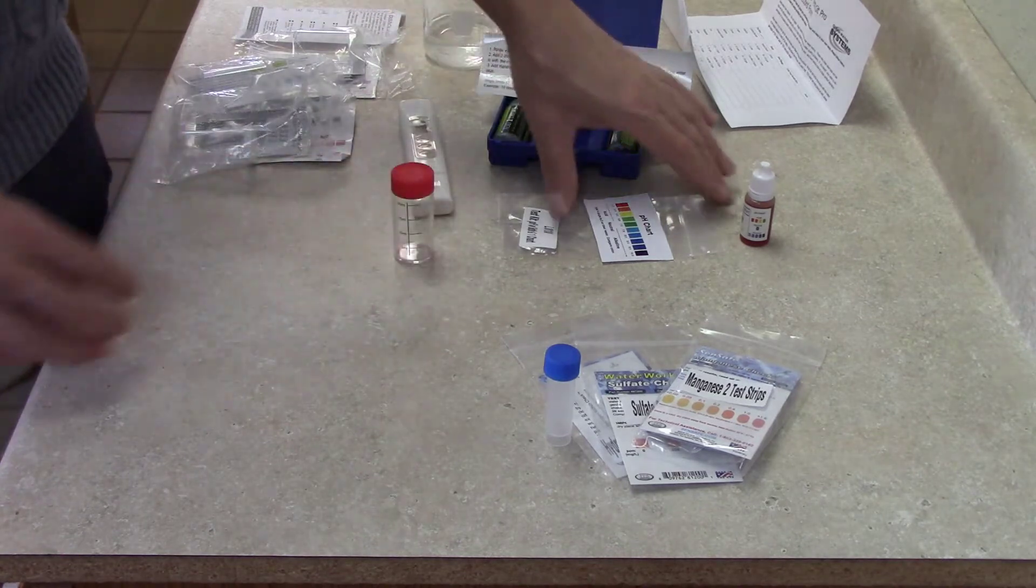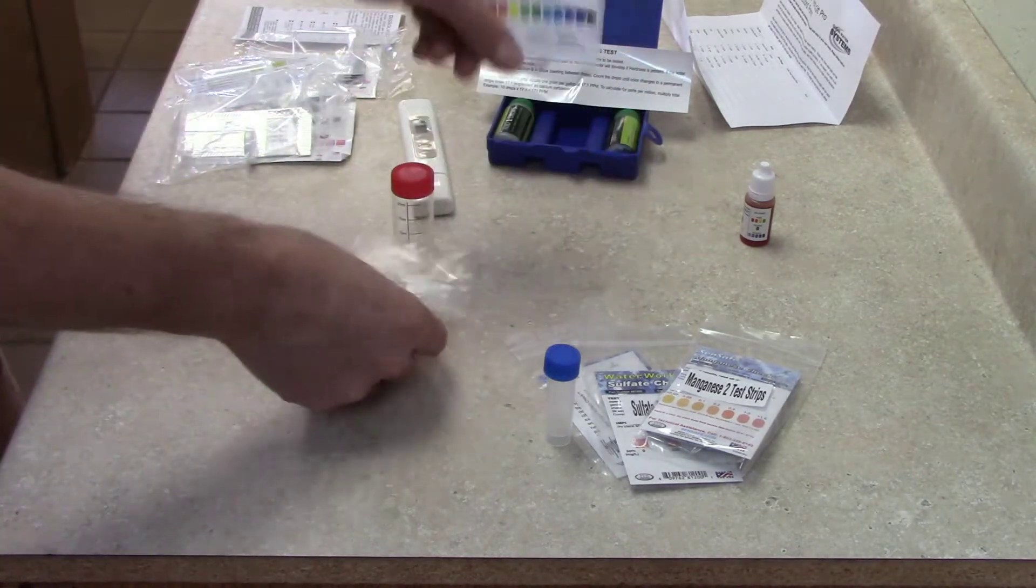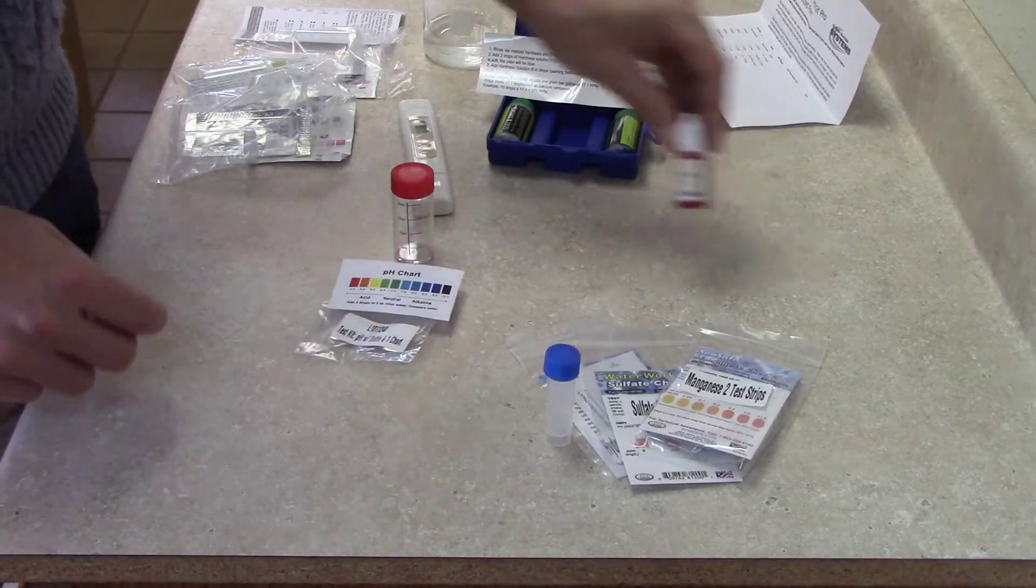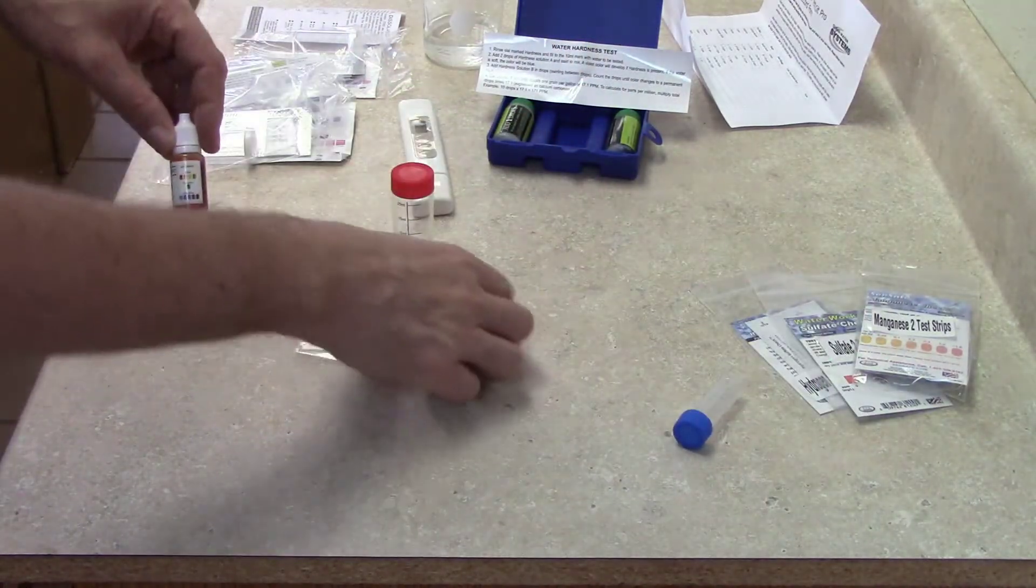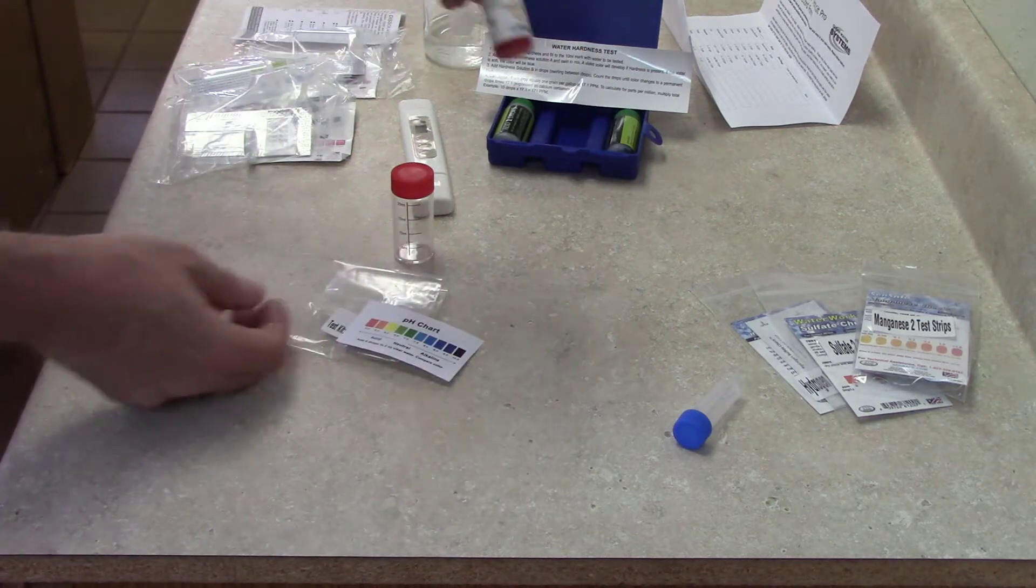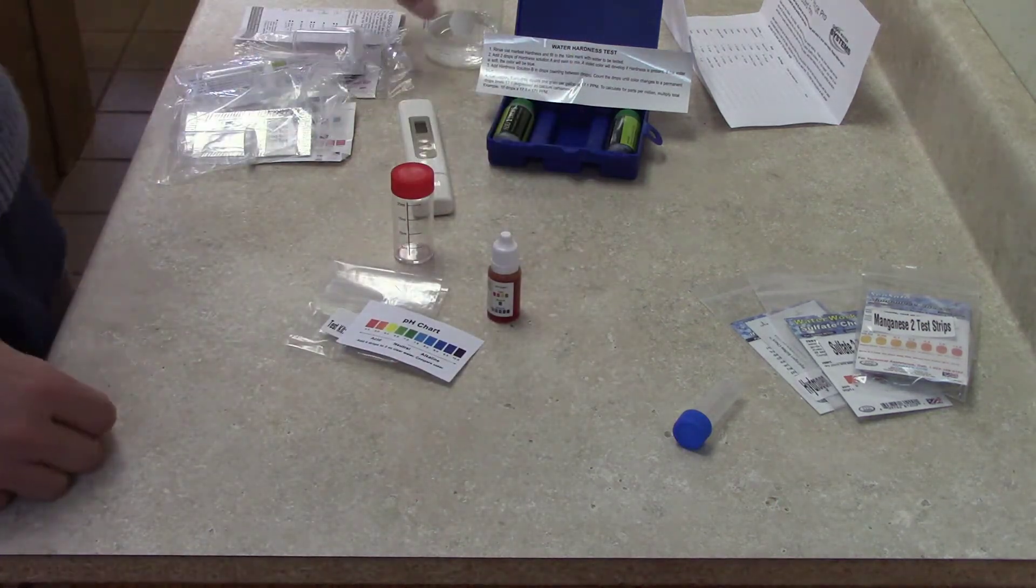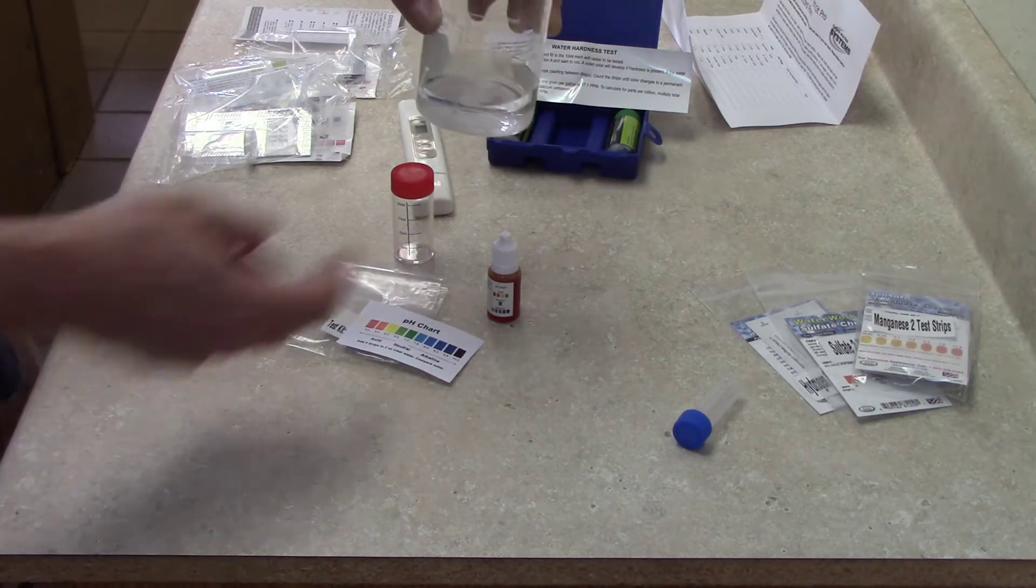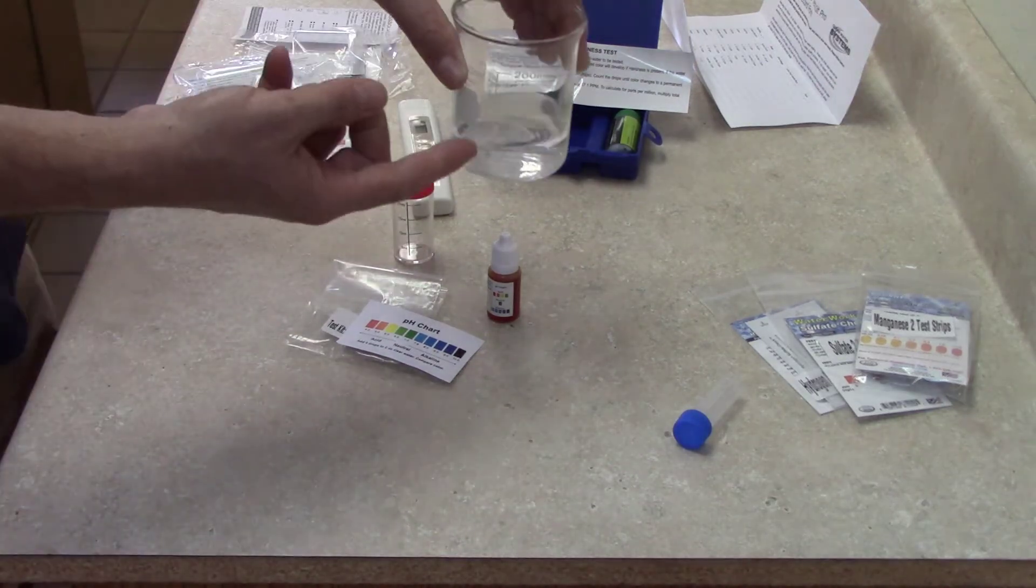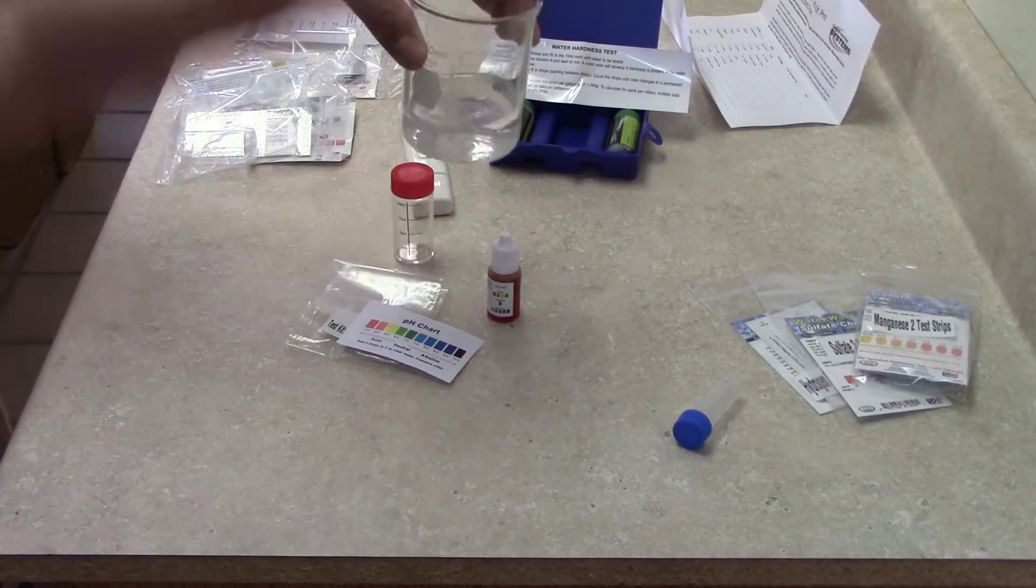Now the last one is for pH. There's your color chart to confirm and your pH drops that you're going to use. The instructions on the chart say add four drops to two ounces of water. You can use just about anything - this is about two ounces, a quarter cup of water. It has to be a clear glass that you can see through.